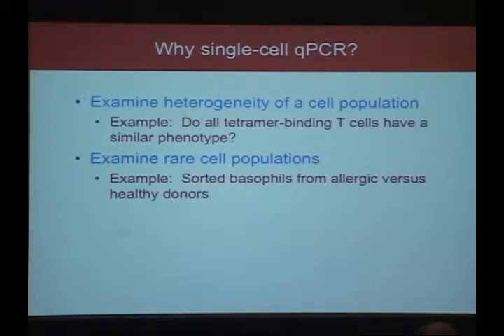Okay, so why single cell qPCR? Which, as you'll see, is one of the fortes of this microfluidic system, the ability to do qPCR on single cells. Well, the main point is that you will often have systems in which you want to look at the heterogeneity of a cell population. And obviously, you've been learning about CyTOF as one approach to look at cell heterogeneity when you have single cells in suspension. But CyTOF is, of course, dependent on having antibody probes to the particular proteins of interest. It's easier to do for surface proteins than intracellular, but in any event, you need to have good antibodies.